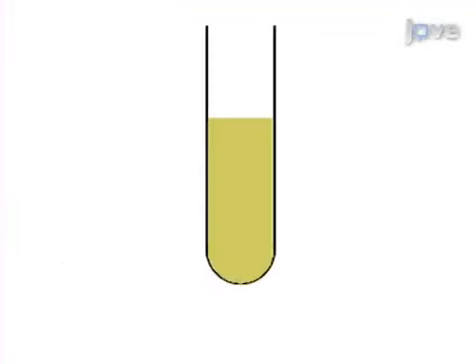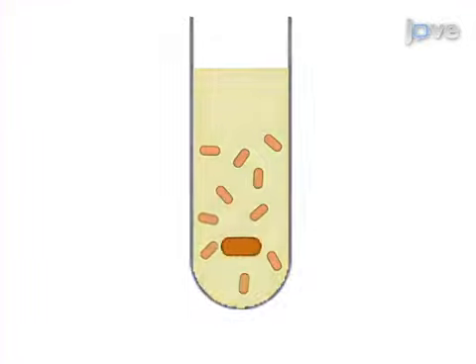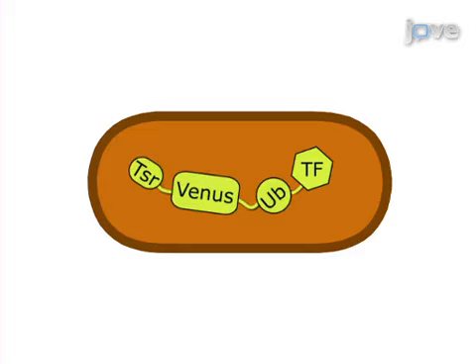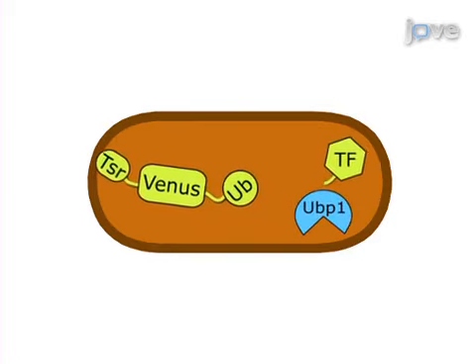This is accomplished by first preparing a sample of cells co-expressing a protein of interest fused to a fluorescent CoTrAC reporter, and a protease that specifically cleaves between the CoTrAC reporter and the protein of interest.